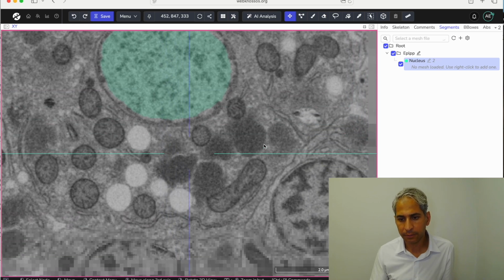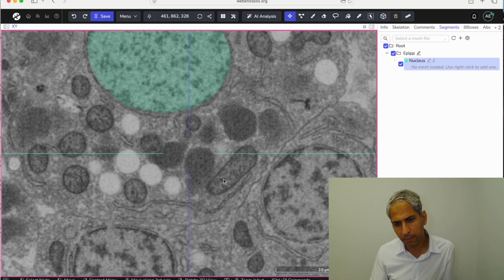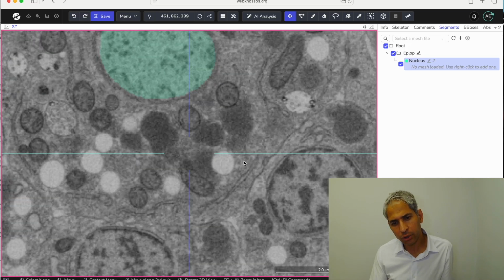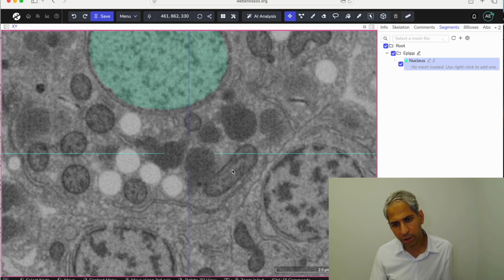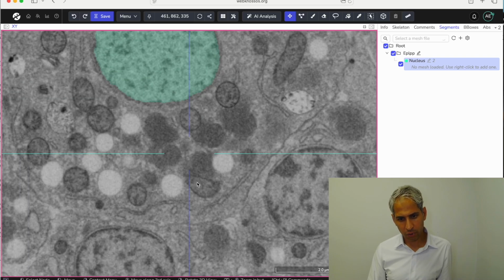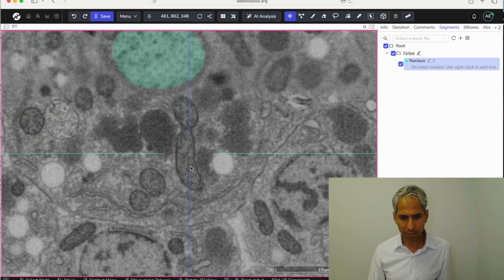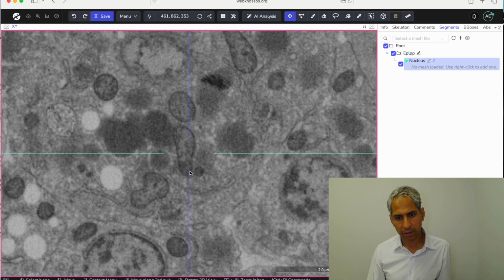If I look around here, I see this over here. Now, if I were to go up and down, it looks like a long noodle-shaped mitochondria, starting over here, stretching like this, and then if I go down, it goes in a little bit to the left, and then it stretches all the way up here towards the nucleus. And then it terminates over here.